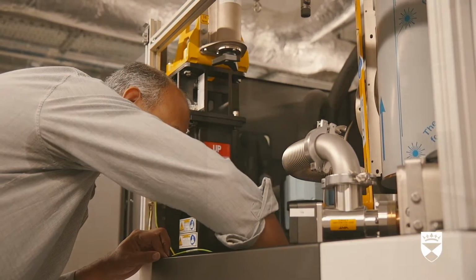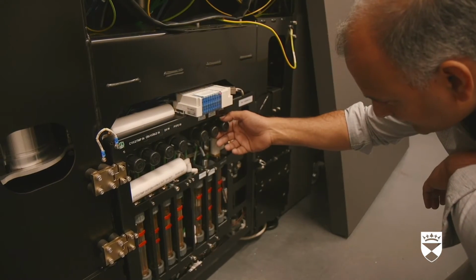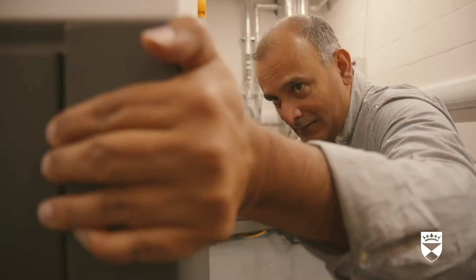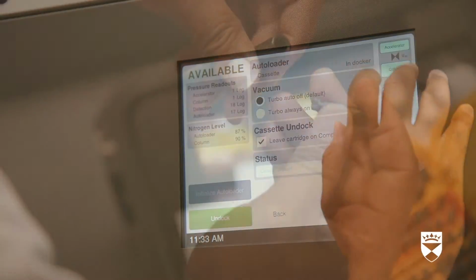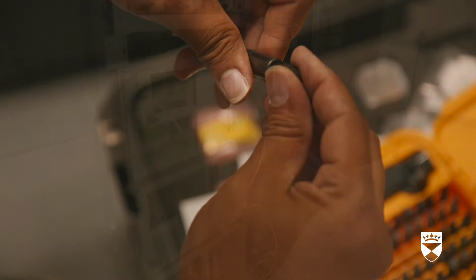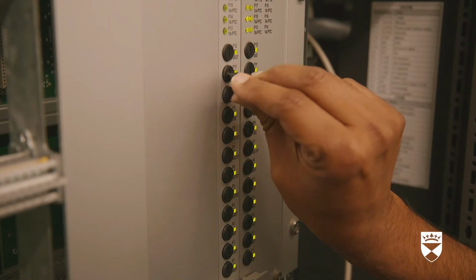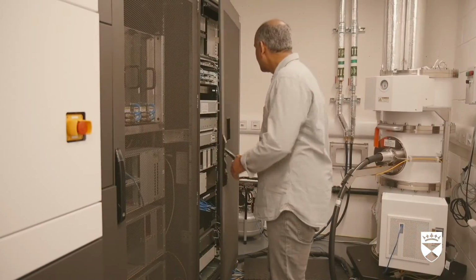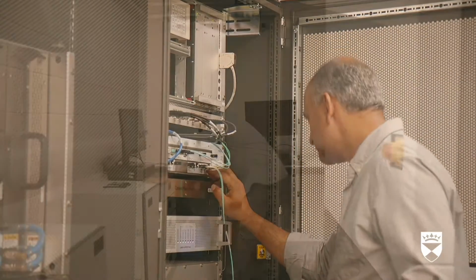Electron microscopes help scientists to see and study proteins. This allows scientists to understand how proteins function and, in some cases, how they are changed in human diseases, such as cancer. In 2022, we opened a new facility in Dundee, housing a state-of-the-art electron microscope. This microscope lets us see more detail than has been previously possible.